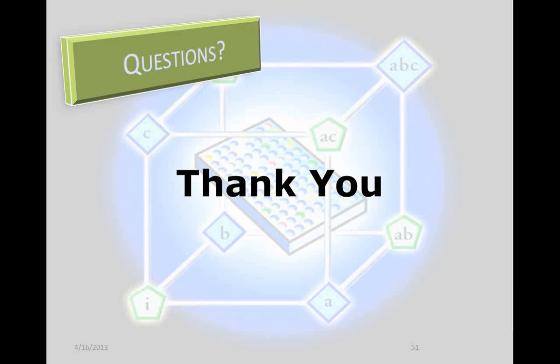Most analysis software can handle up to about 30. There are some packages that are limited to 15 or so. So it depends on your statisticians and which statistics package you're using. I know that Design Expert will let you go to 30 variables. We typically don't recommend going over about 15 because it gets to be just too much to keep track of. But if you're comfortable doing that and have good support, go for it. Thanks, Sean.